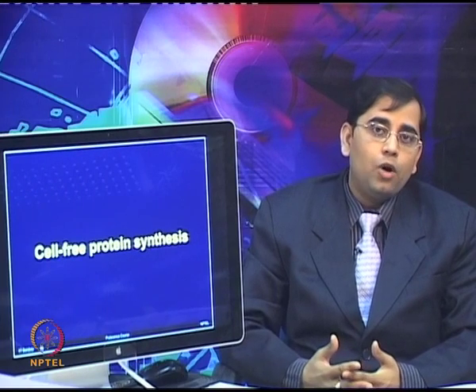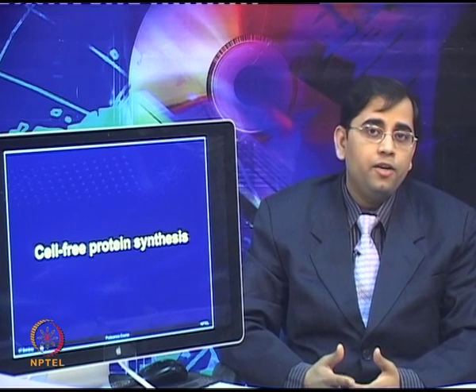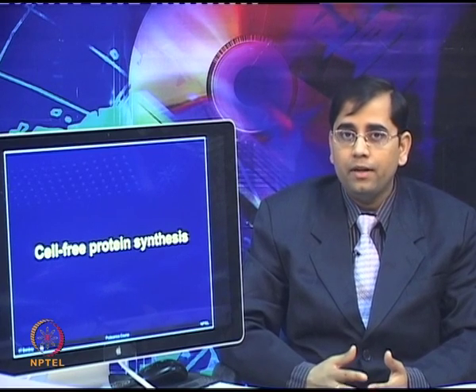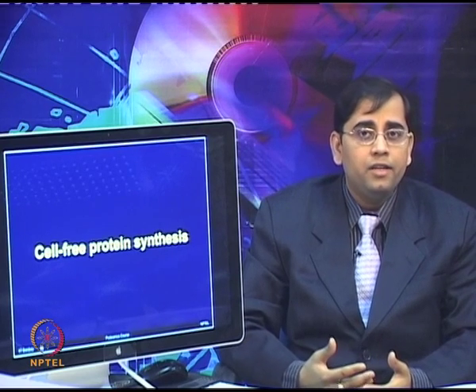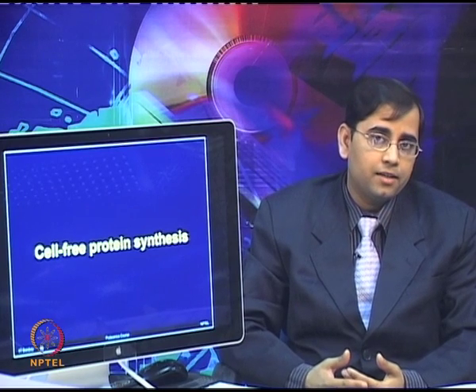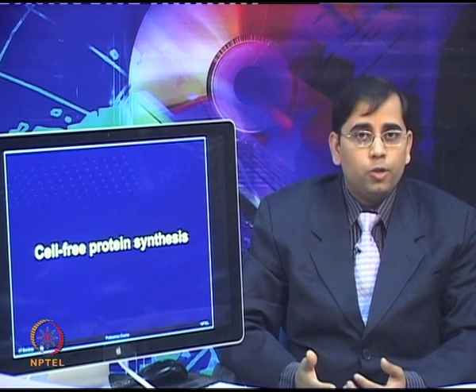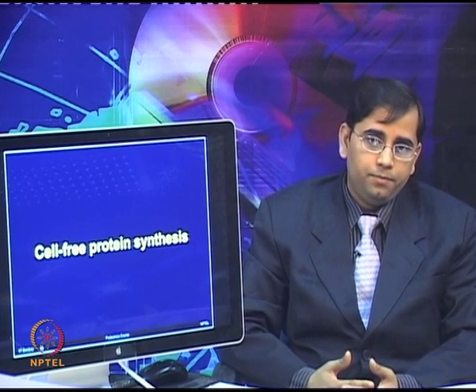But since the requirement for doing microarrays is in a high throughput manner, it is very difficult if you have to purify thousands and thousands of proteins, especially when you want to preserve their activity and do functional assays, functional activity testing. To eliminate all those problems, people have started using the cell-free protein synthesis method.